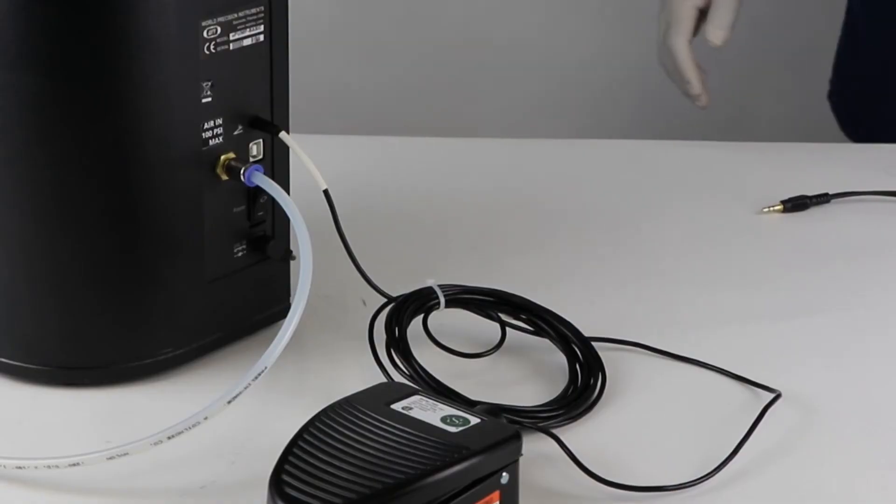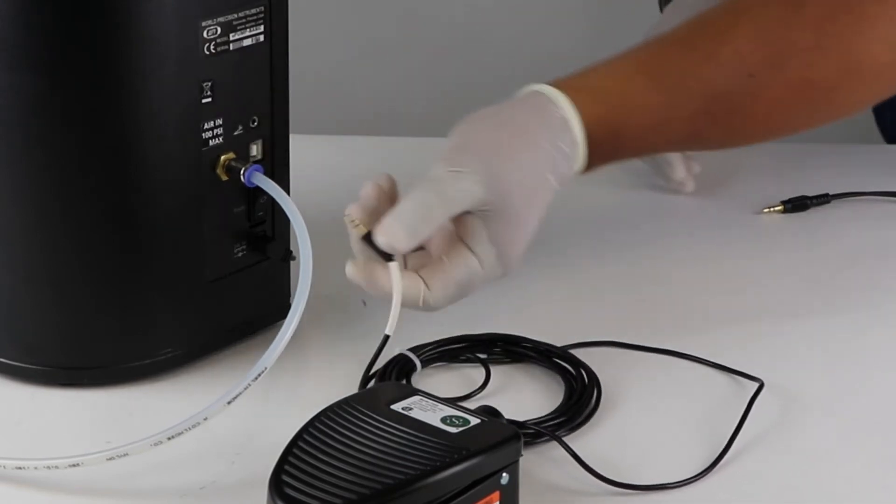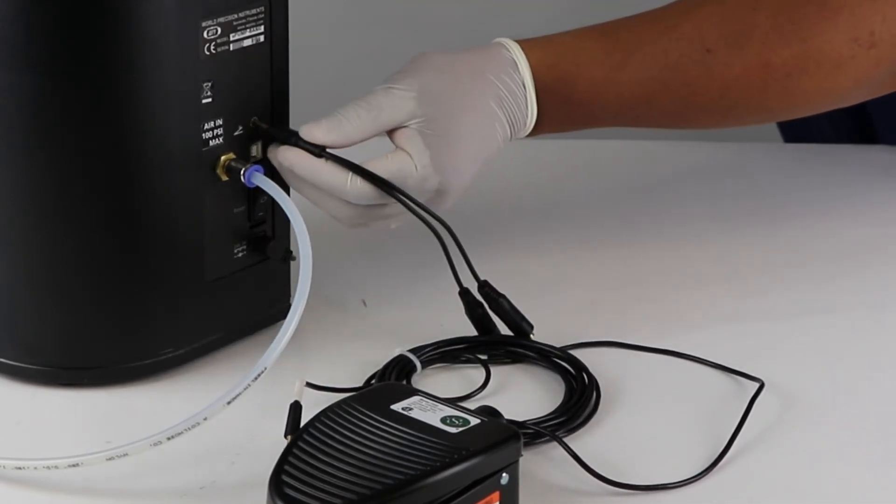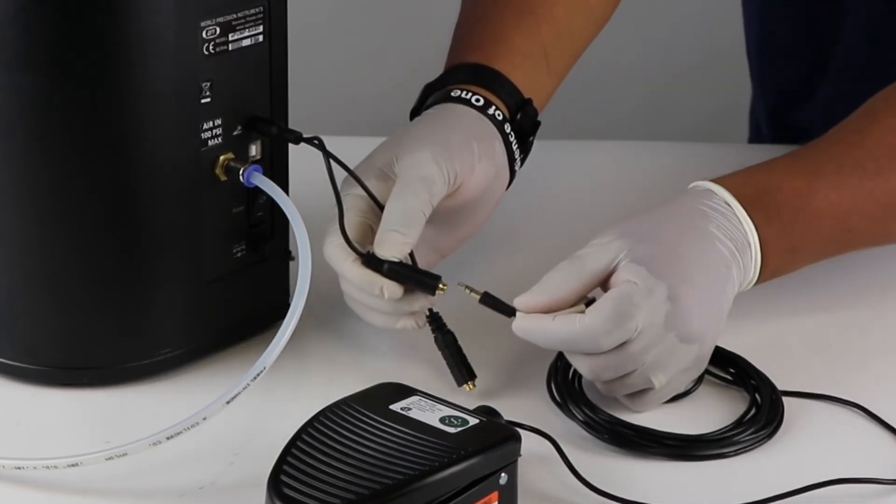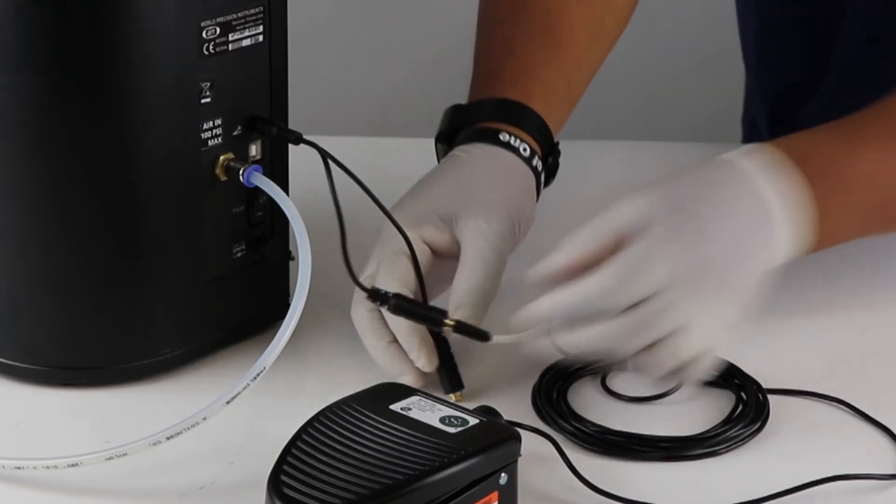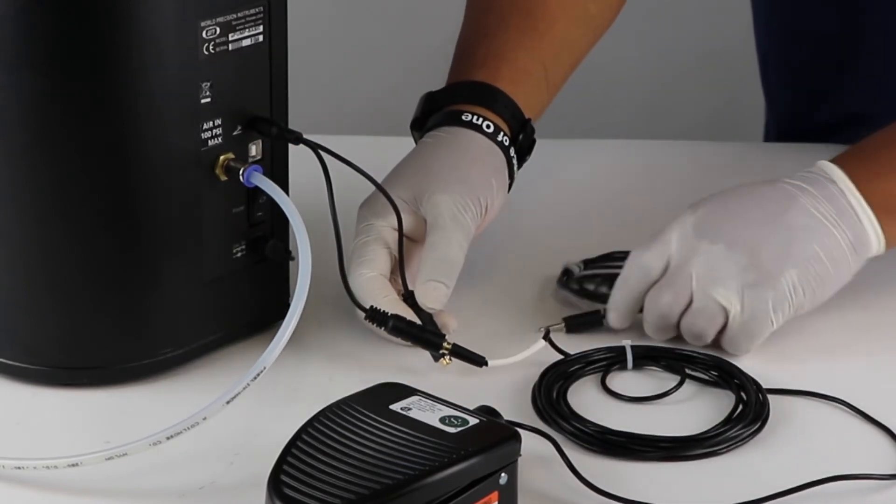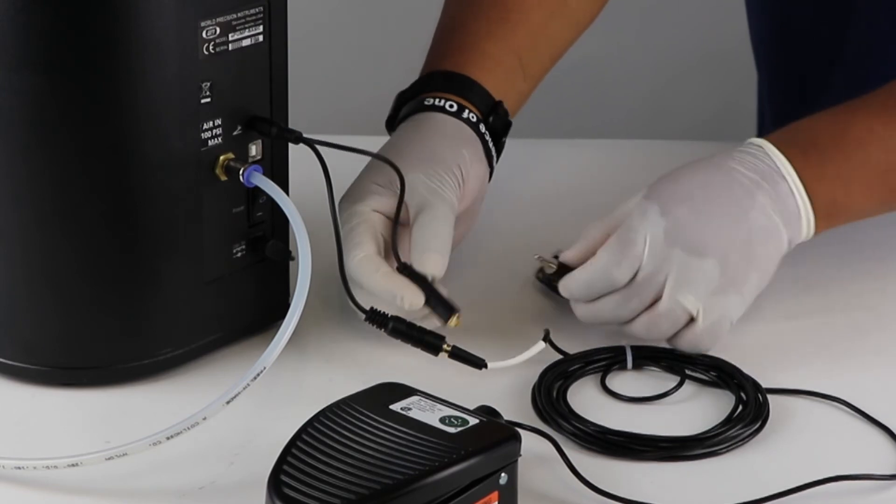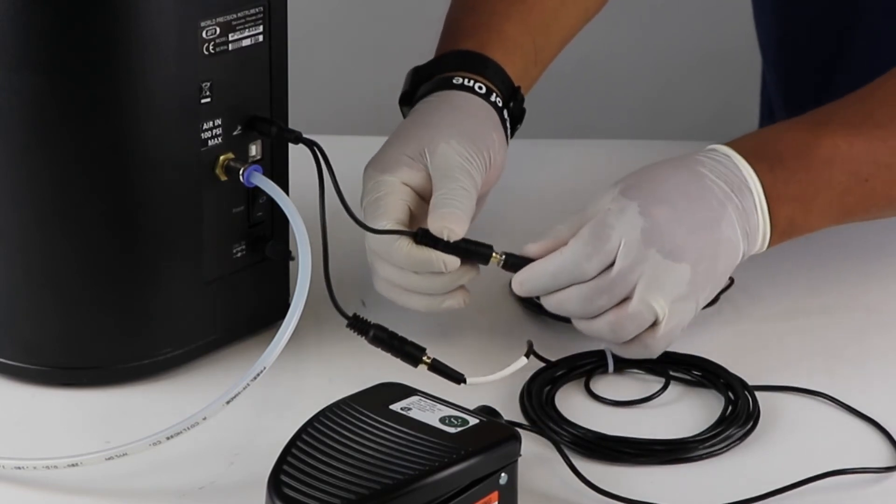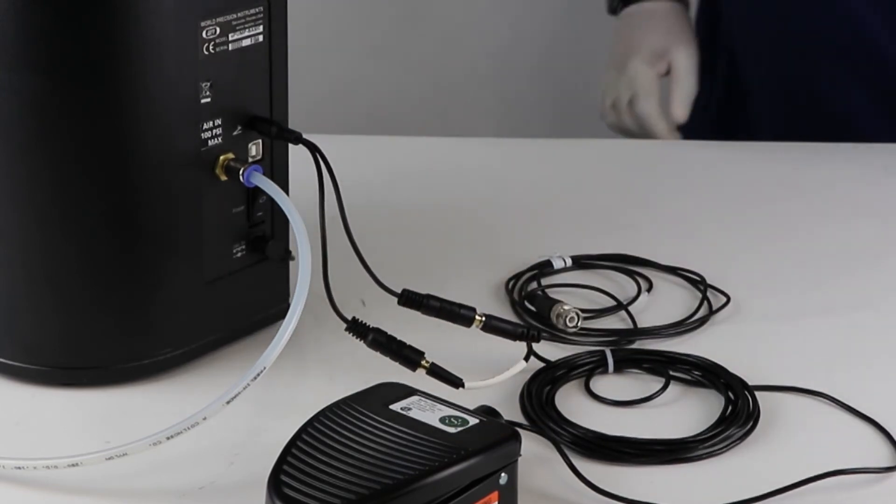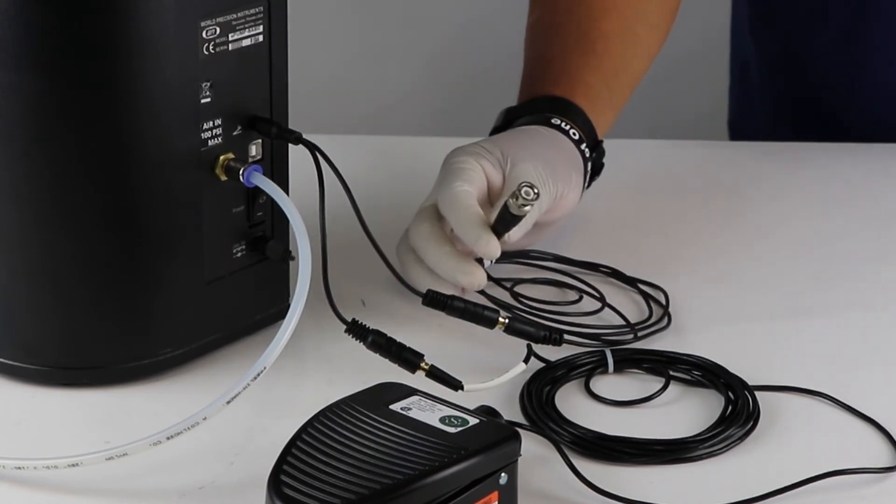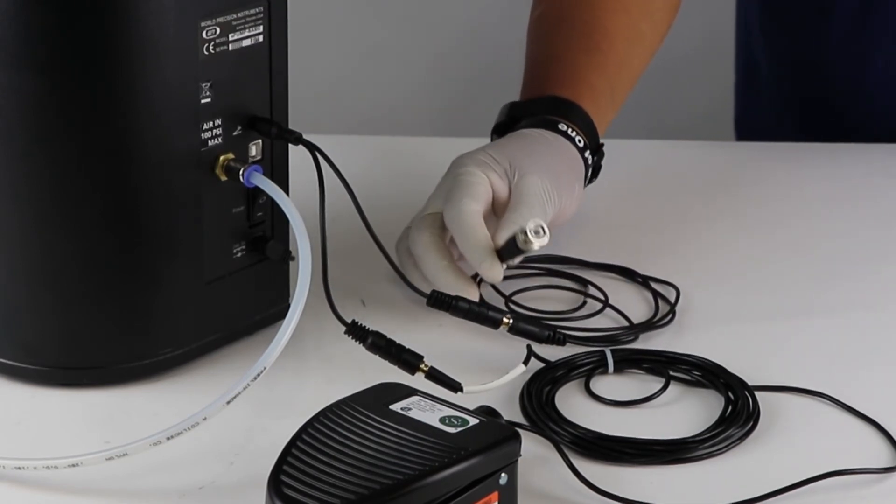If you wish to use a computer or pulse generator to send a TTL pulse to trigger an injection, then connect the Y stereo splitter to the foot switch port on the rear of the PV850. Connect the CBL102 jack to one of the female ports on the Y stereo splitter and then plug the BNC cable into the appropriate TTL port on your pulse generator.